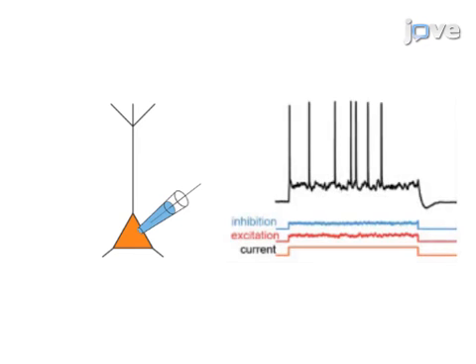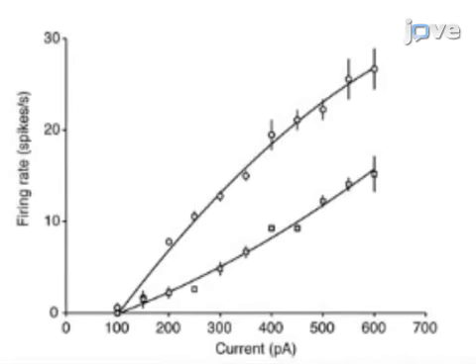Next, the injection of excitatory and inhibitory synaptic events is simulated in order to recreate the high conductance state experienced by the neocortical neurons in vivo. The results show how background synaptic injection modulates the gain of the cortical cells.